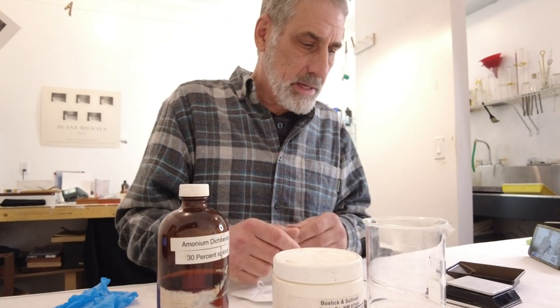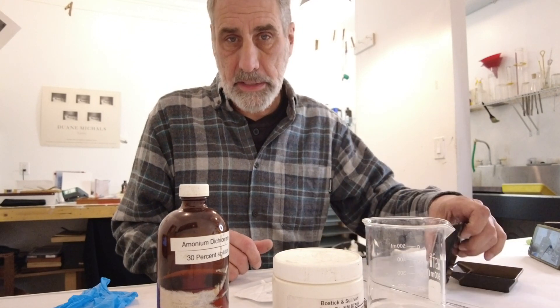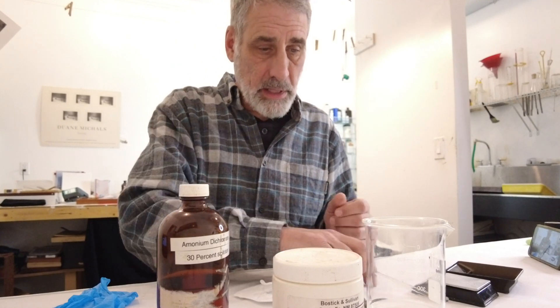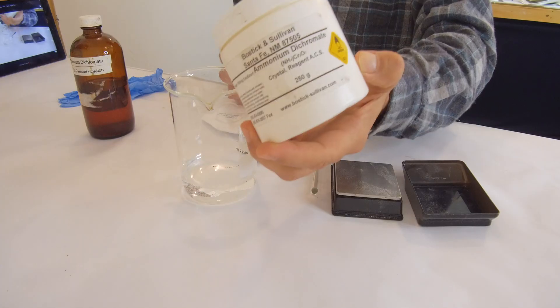We're going to be mixing up 30 grams. For this procedure you're going to need a scale, of course. I like to use glass stirring rods and glass beakers. You're also going to want to have ammonium dichromate — I get mine directly from Bostick and Sullivan.